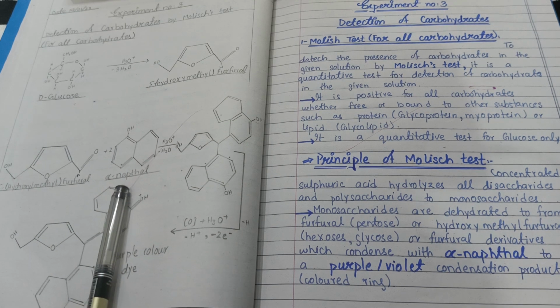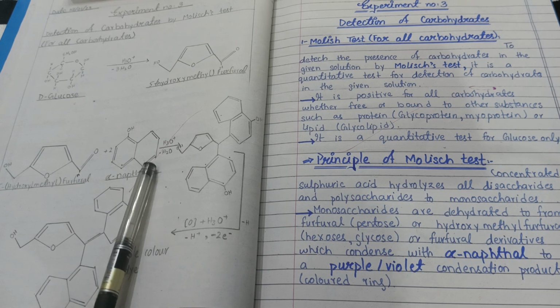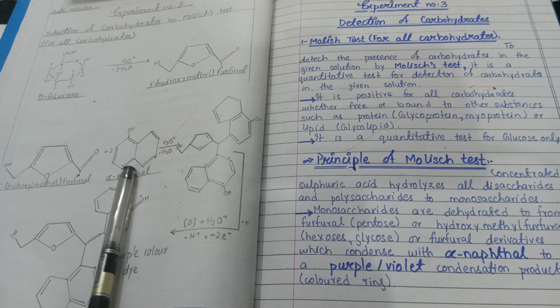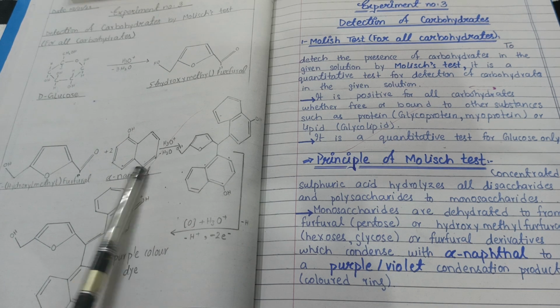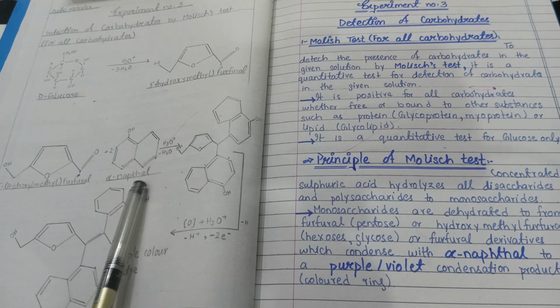For the next step, after the preparation of 5-hydroxymethyl furfural, you have to add alpha-naphthol. First you have to draw the naphthalene structure. All of you know very well that naphthalene has two fused benzene rings. Now to make alpha-naphthol, as its name indicates, it has an OH group.